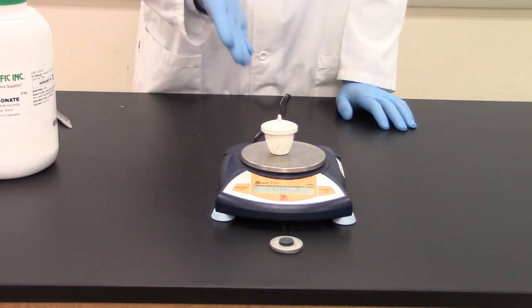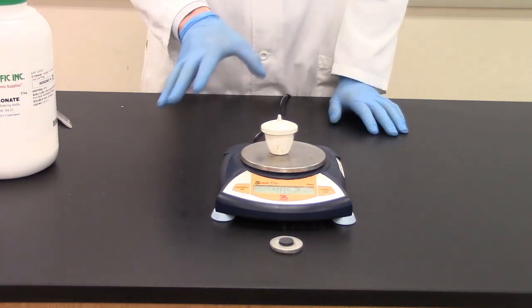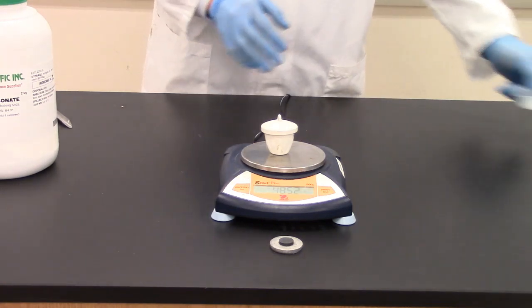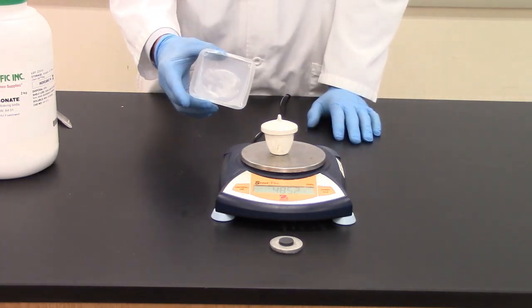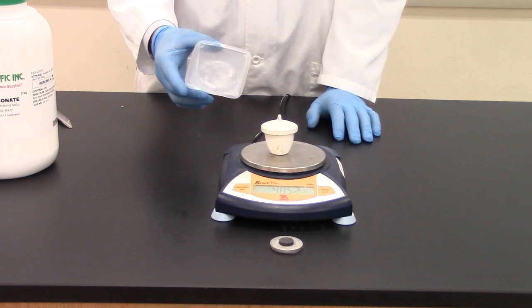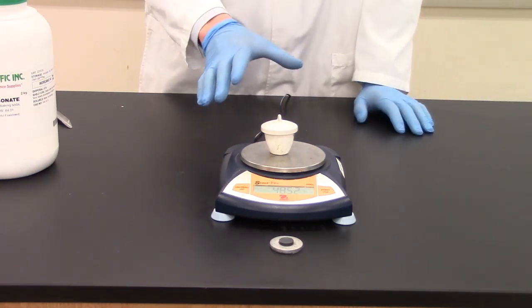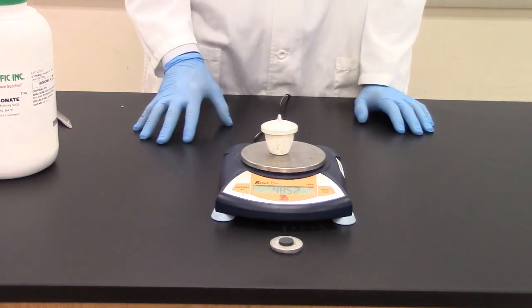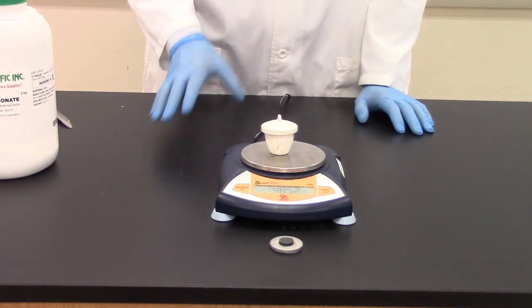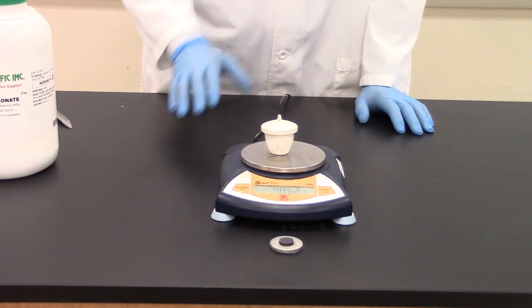So how would I get the mass of just the sodium bicarbonate? We did take a mass earlier but sometimes we get some residue that's left over in the container. We want to be as accurate as possible when we take our measurements. So if I've got the mass of the sodium bicarbonate and the container and then I have the mass of the empty container, how would I get the mass of just the sodium bicarbonate by itself?